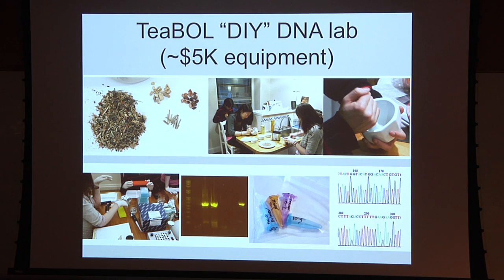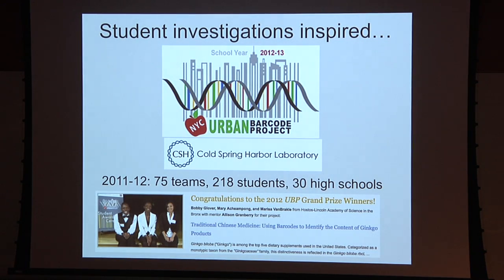It's not quite a toaster yet, but I think DNA analysis is going in that direction. Then we mailed these off to Macrogen for sequencing. So it's a very robust technology, a lot of interesting things you can learn.